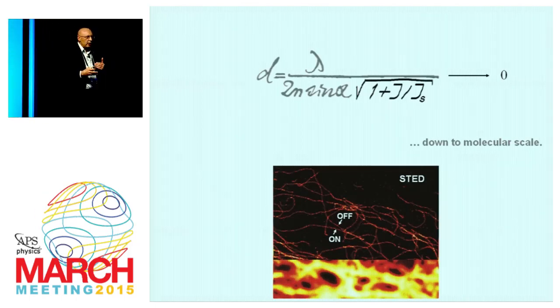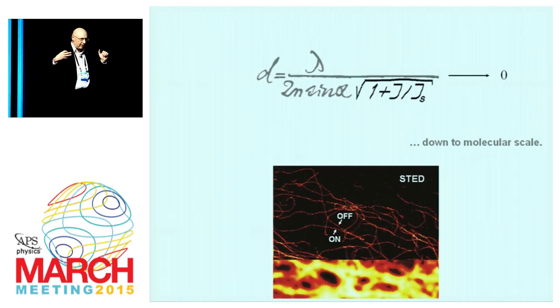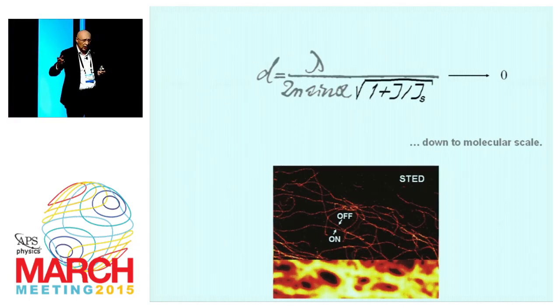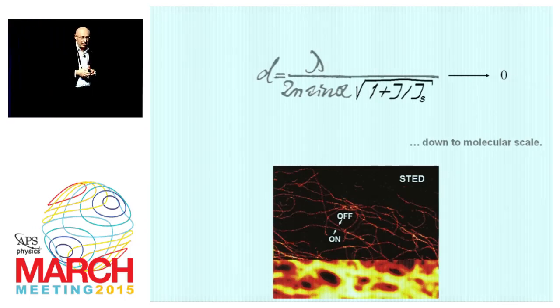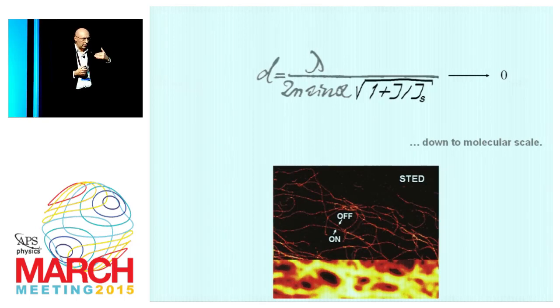Yeah, so it depends on the way you focus the light. You can squeeze the area in which the on state is allowed also in the Z direction. In fact, the first experiments did that. Then we later on moved to X and Y. The best way of doing that, the highest resolution you get, is by using two objective lenses, opposing lenses, that produce a kind of focal interference pattern in the Z direction. I called it at some point a 4-pi microscope. In fact, Harald Hess is going to talk about such schemes. And in that case, if you do it very well, you get down to 20 nanometer or even 10 nanometer resolution in the Z direction.